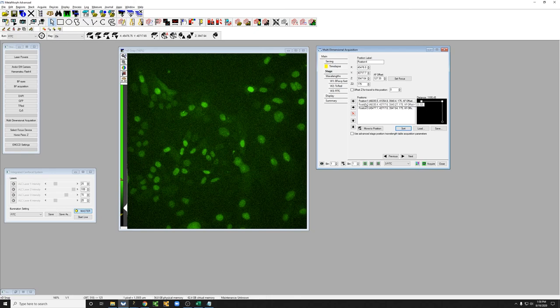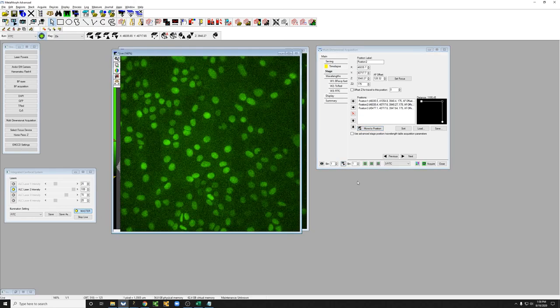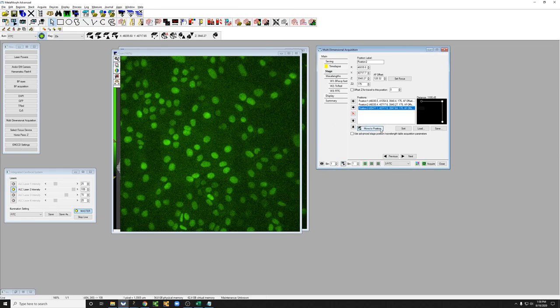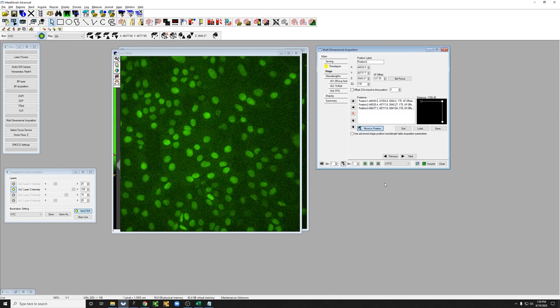It's also the case that if you click on one of the positions and click on move to position, the stage automatically goes there. So if you are, for example, here and you want to go to position number three, you can move to it.